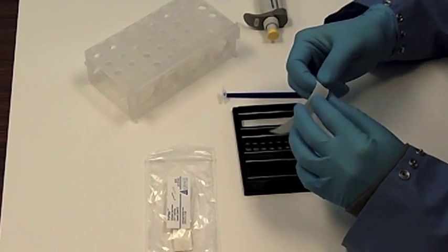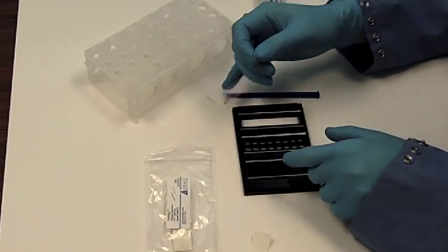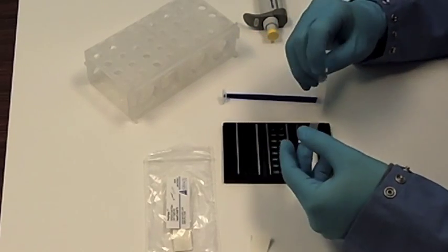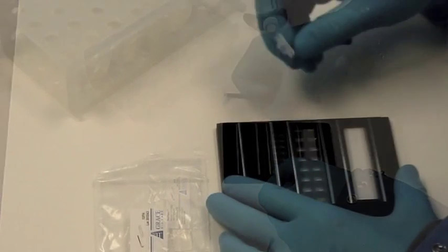Prior to hybridization, seal strips are used to ensure segregation between chambers. Seal strips are applied to the chamber assembly. The non-adhesive backing is removed and seal strips are placed over the top of the chambers.